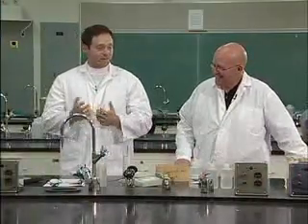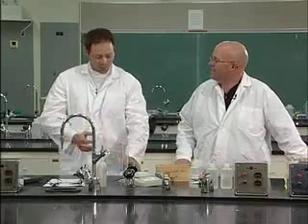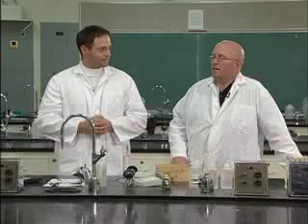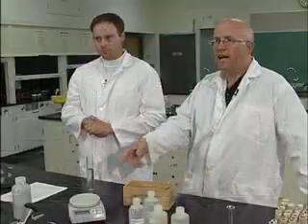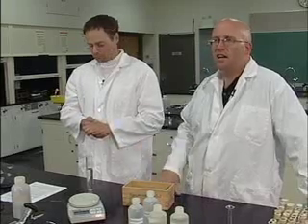So if we have an exact volume of 80 milliliters, and we had an initial volume of 70 milliliters, that makes the volume of our object 10 milliliters. And the way I figured that out is quite complex. I took our final volume, subtracted our initial volume, and got the volume of our object. So now to figure out density for tin number, what was it? 6. Tin number 6, I would just take the mass, which we got before, and divide it by whatever I got for the volume. And the calculations, I think, are in the lab.